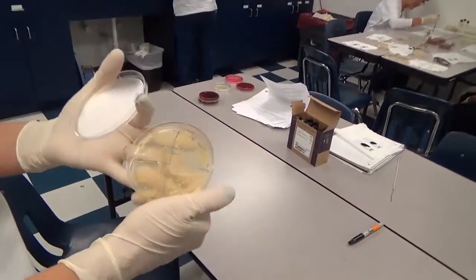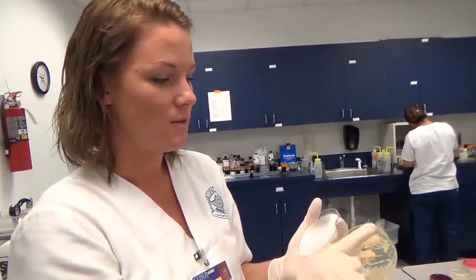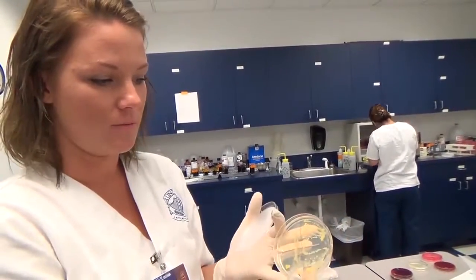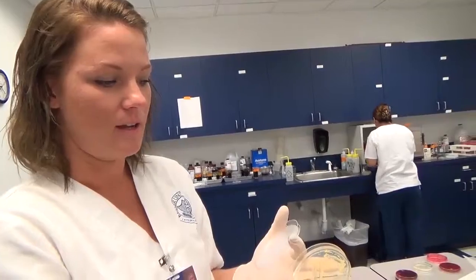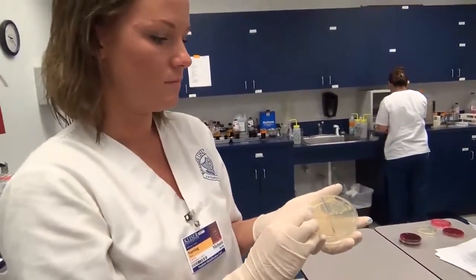This is a smear plate and we're trying to single out colonies to grow. How long will that take? This one we did on Monday, but it'll look like this overnight. And then when you're done with that, you take a specimen off of that plate and put it onto a slide.